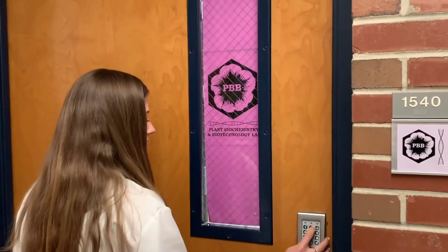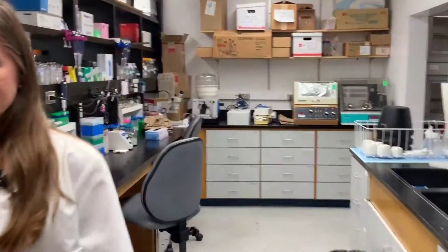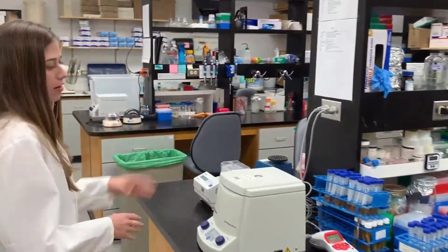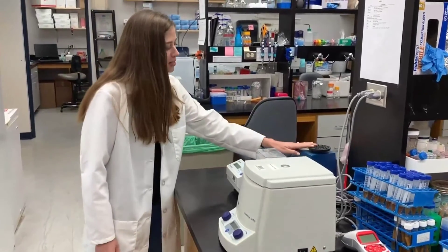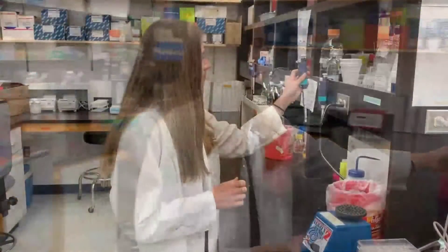Welcome to our molecular biology lab. Let's go inside. In here is our wet lab, where we do all of our reactions involving DNA extractions, RNA or protein work, as well as mixing different chemicals in this room. We have a lot of equipment that we use to spin things down, to mix things up, heat them up, and also to measure and pour.